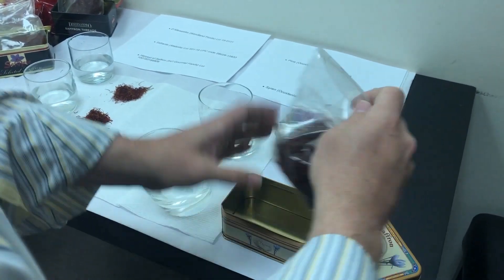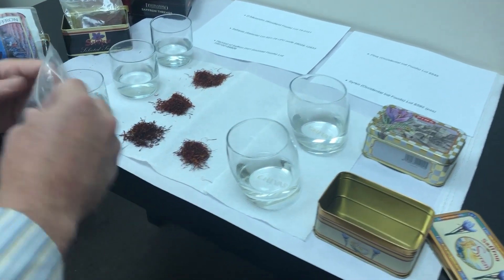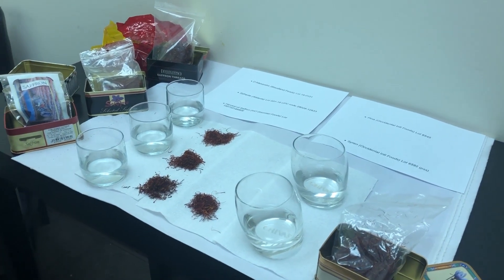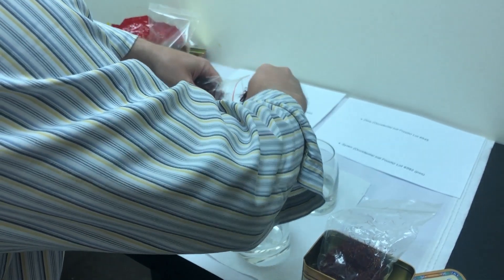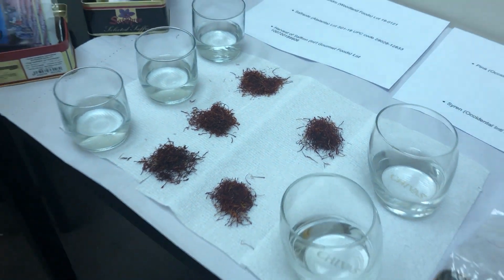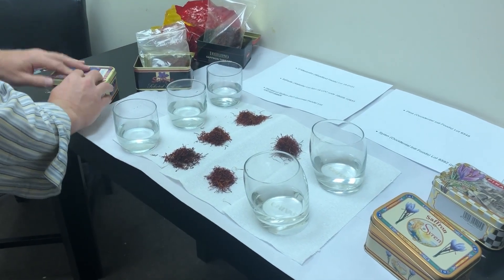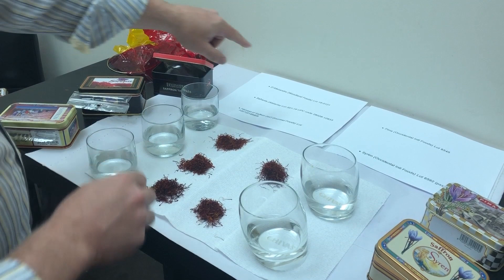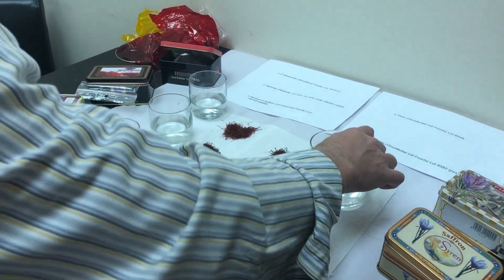Now we'll take a quick pinch of the Occidental Foods saffron — this is a pre-shipment sample for a bulk one-pound tin, lot 6592. The threads are a very nice length, about 20 to 30 millimeters or about one inch on average. This is also Occidental Foods Pina Brand lot 6545, which we compared to Roland Brand in previous videos. We have D'Alessandro on top, Saffrante in the middle, Harvest of Saffron on the bottom, Siren Occidental Foods on the right bottom, and Pina Occidental Foods on the right top.